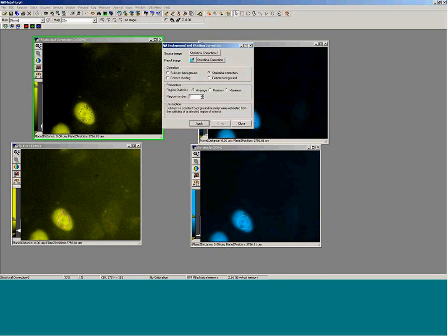So the images that you're generating from these formulas are corrected FRET, so they're intensity images. It is not any efficiency calculations, and again, this is another, I wouldn't say controversy is a strong term, but there's a lot of discussion on how to calculate FRET efficiency.